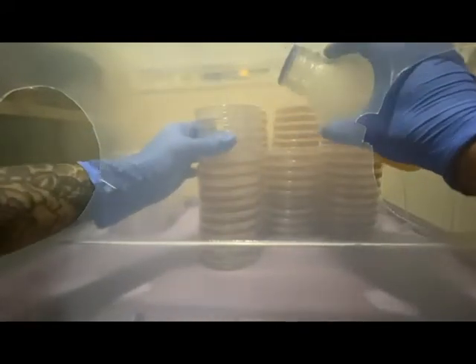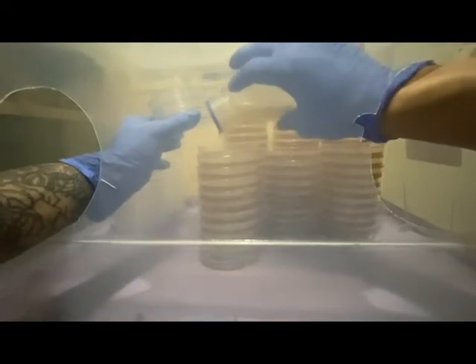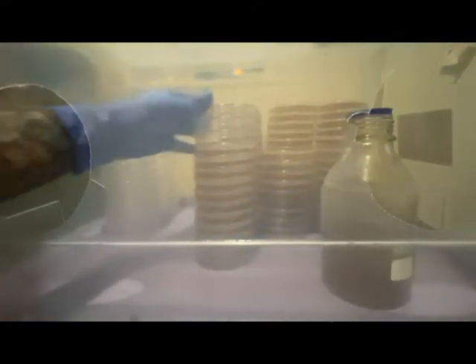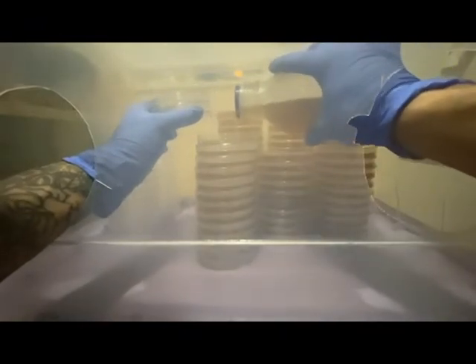I do, however, have a lab grade digital water hot bath, which does make things pretty awesome. It means you get to take your time a little bit. And when I mean take your time a little bit, I mean taking time in between pouring media bottles. I'm not taking time pouring a media bottle.